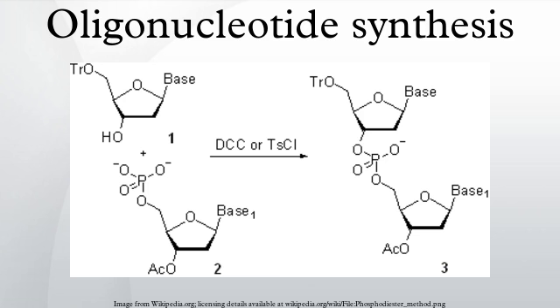The coupling of 2'-deoxynucleoside phosphoramidites is very rapid and requires, on small scale, about 20 s for its completion. In contrast, sterically hindered 2'-O-protected ribonucleoside phosphoramidites require 5 to 15 minutes to be coupled in high yields. The reaction is also highly sensitive to the presence of water, particularly when dilute solutions of phosphoramidites are used, and is commonly carried out in anhydrous acetonitrile.